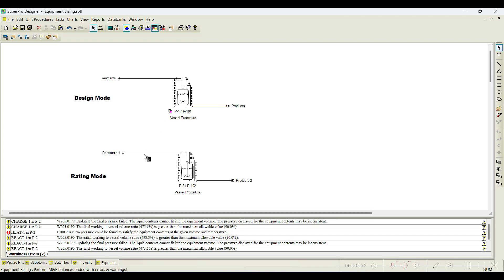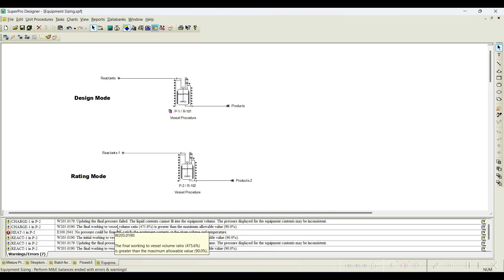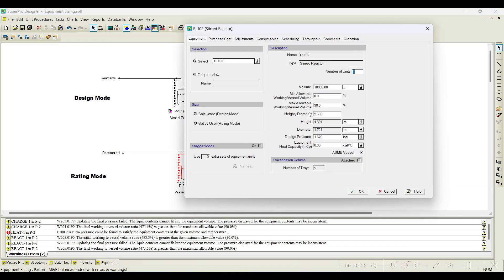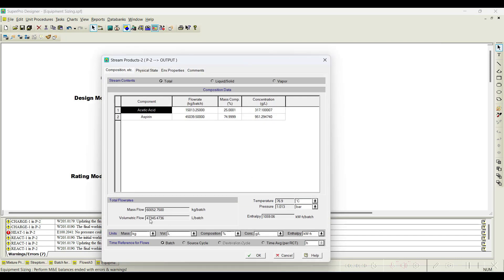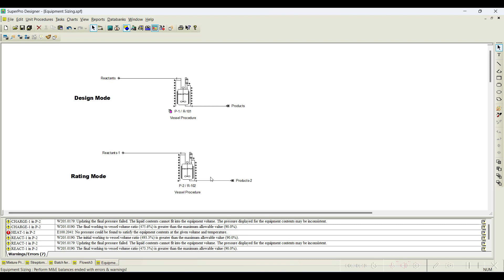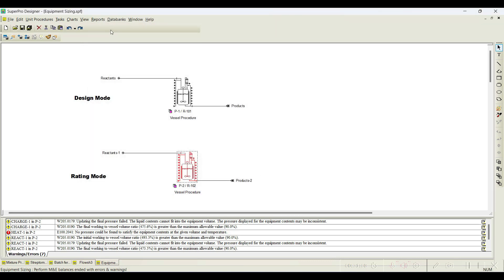In rating mode, with 500 kilomoles per batch, the warning states the final working volume to vessel volume ratio is 475.6%, which is greater than the maximum allowable 90%. Going to equipment data, the reactor is set to 10,000 liters, but the output is again about 47,000 liters of reaction mixture. So five reactors are obviously required. In rating mode, the number of units field gets activated — I enter approximately five units and click OK.